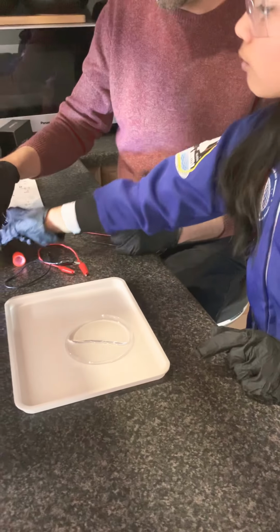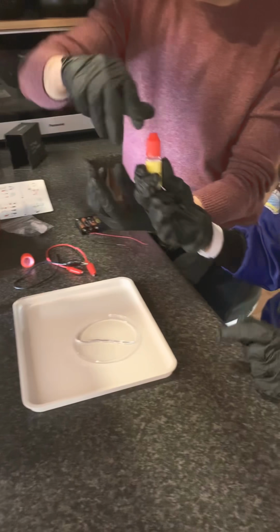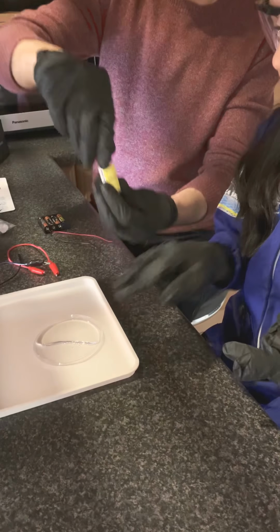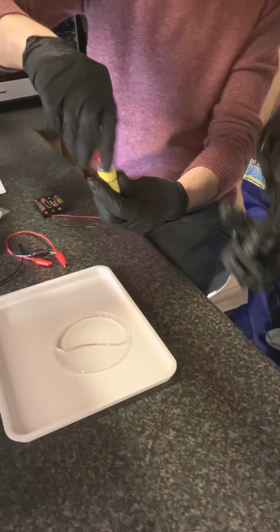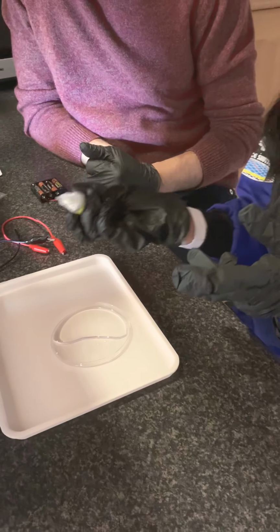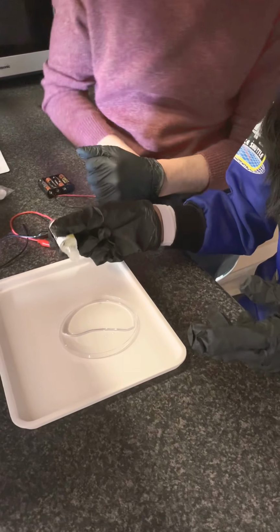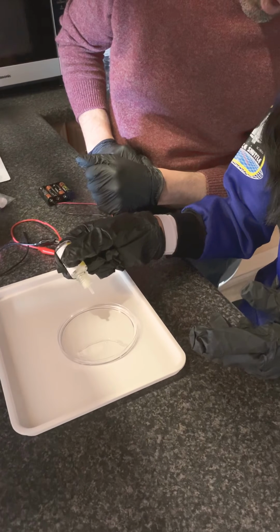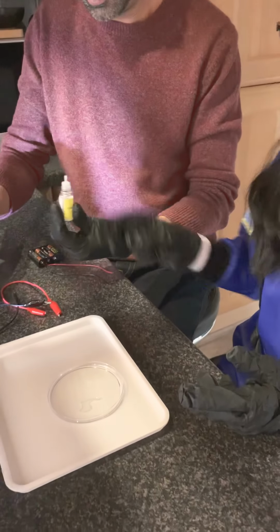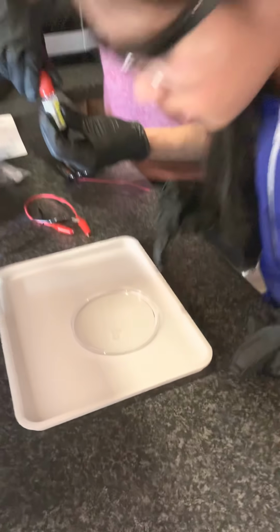Very good. Now we will get our liquid soap and we need to add 2 drops of liquid soap inside the solution. And make sure you add no more or no less than 2 drops. 1, and 2. Excellent. And then it'll make all of it go together.